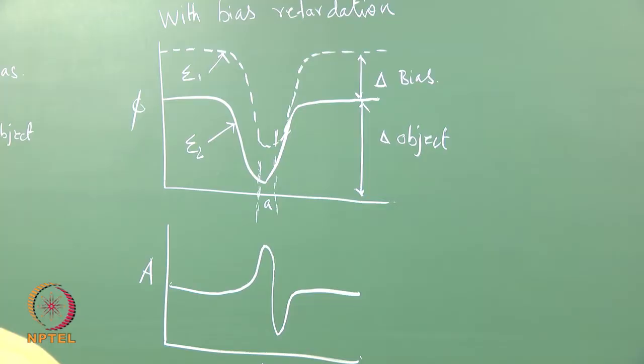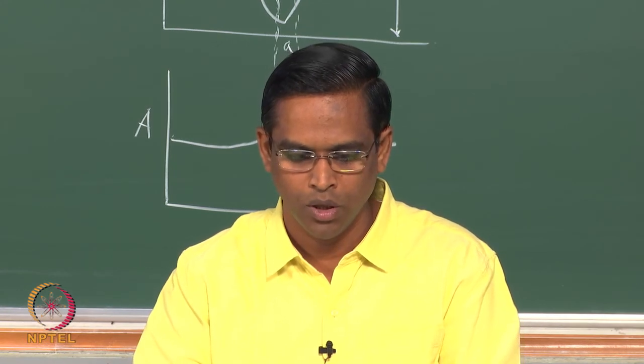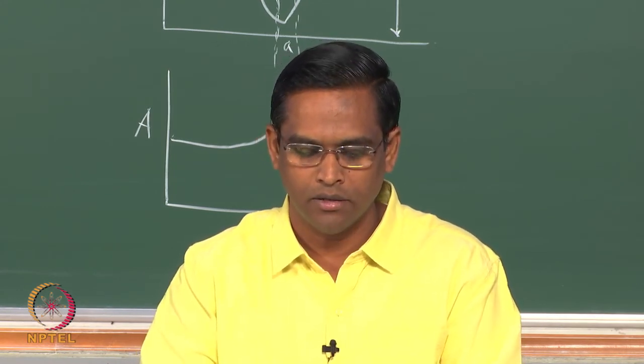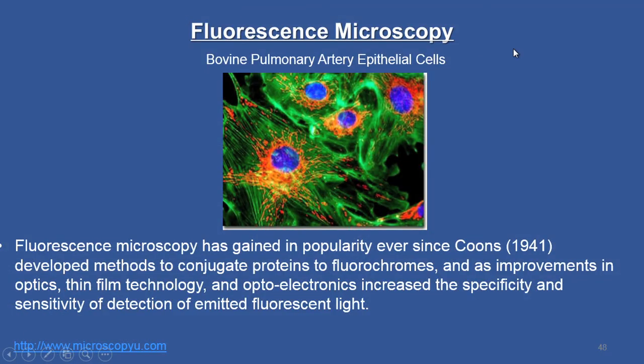So now we will move on to the last variant of the optical microscopy called fluorescence microscopy. Look at this image, which again is taken from this website.